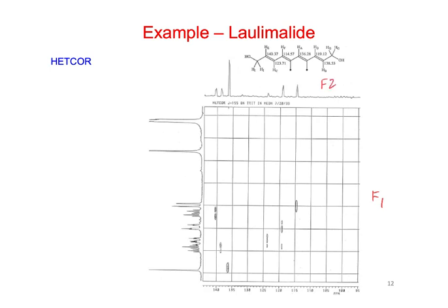Notice that this C13 doesn't look that great, so this one is actually a projection. What it is doing is just taking that two-dimensional data and looking at it from the side. So it's not a plot of the high-resolution C13 NMR data. Okay? And like we saw before, it's just telling us which protons are attached to which carbons.